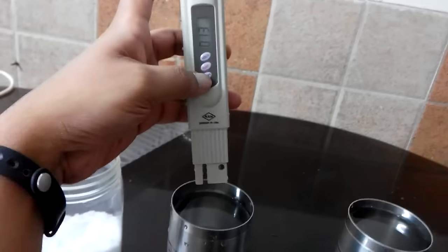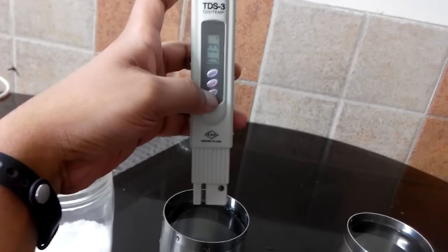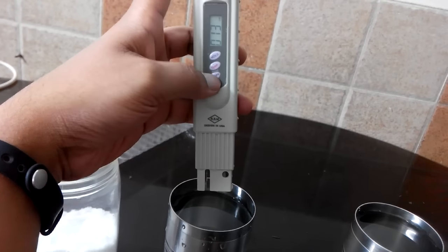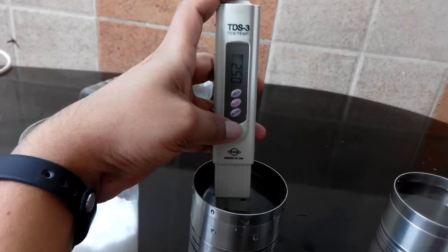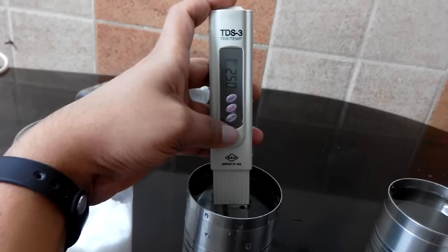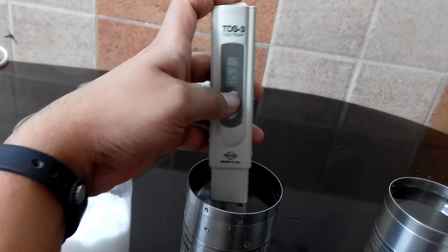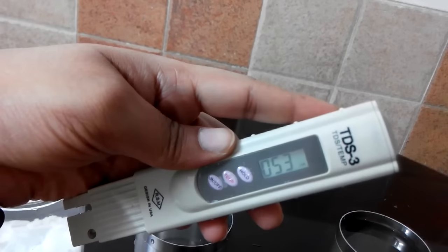Now I'll put it into the tap water. Ideally it should have more TDS than the drinking water. I'll press the hold button again and put it inside. The reading has stabilized — 53. I'll press the hold button and take it out. As you can see, it says 53 ppm.